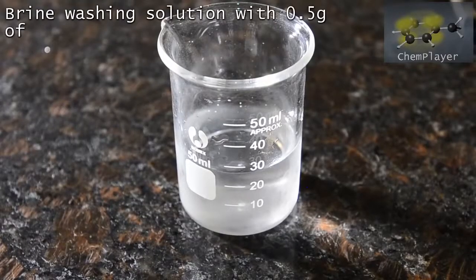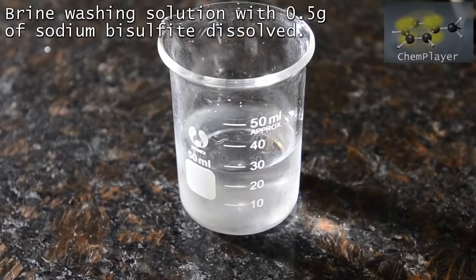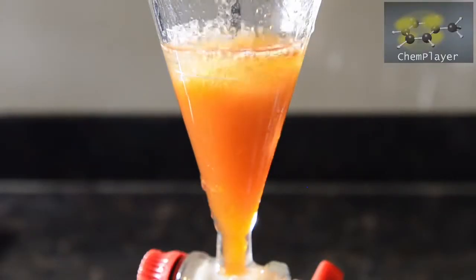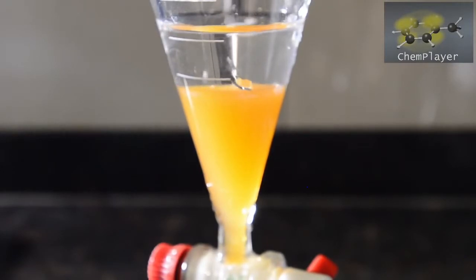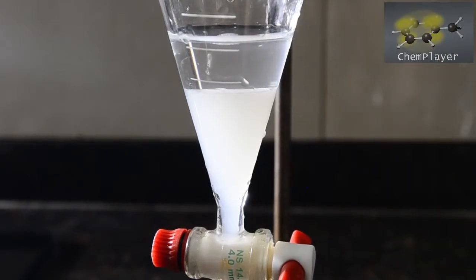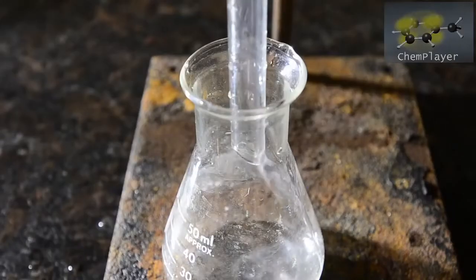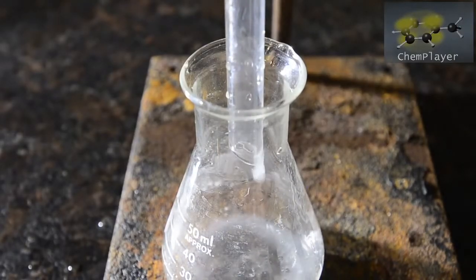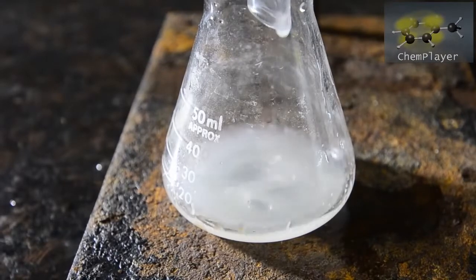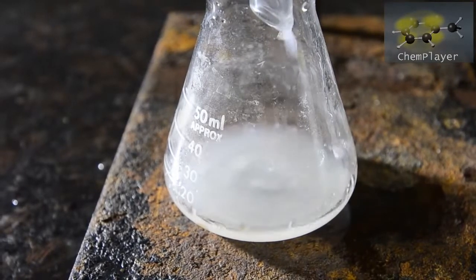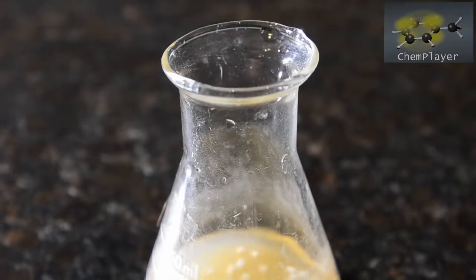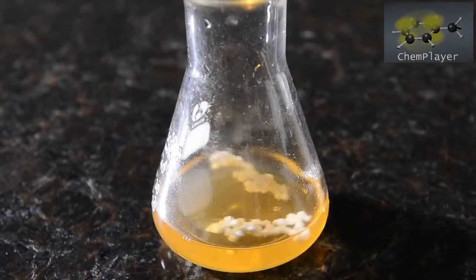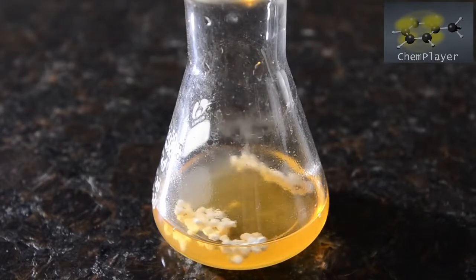This time we used the same washing solution but with a small amount of sodium bisulfite dissolved in. On shaking, this gradually removed a lot of the yellow color from the liquid. We drained off the milky bottom layer, and then we added some anhydrous calcium chloride to dry the liquid. With a bit of swirling, this quickly produced a clear liquid but still with a bit of a yellow tint.